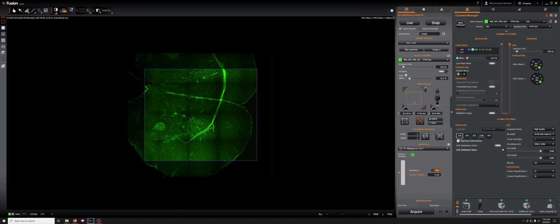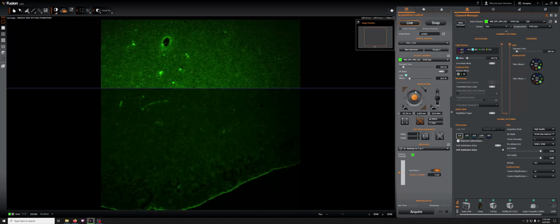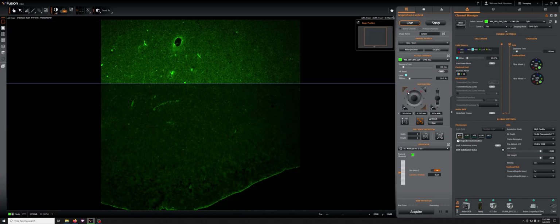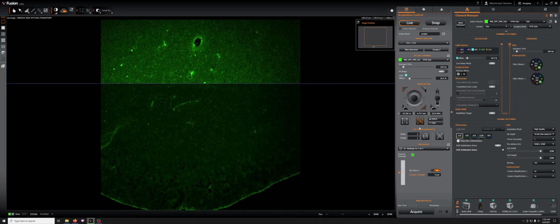If you want to move using the joystick, when you have set boundaries, there is something that occurs, which is the joystick will not let you move beyond the boundaries that you've marked. And you will get these red indicators telling you you can't move beyond there. It just won't let you.